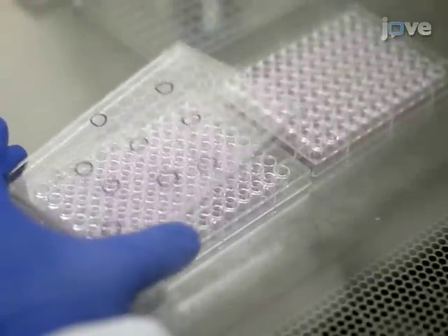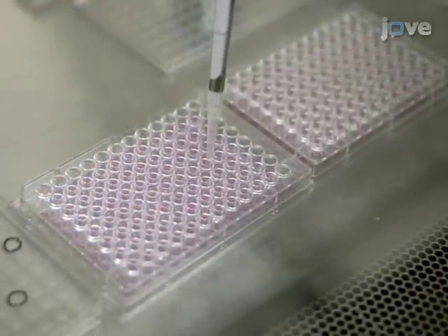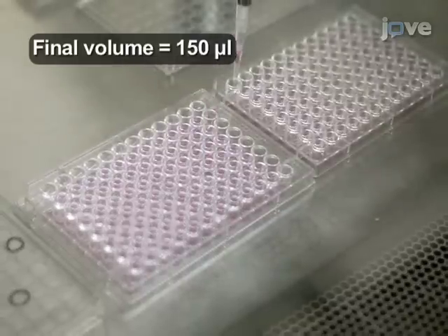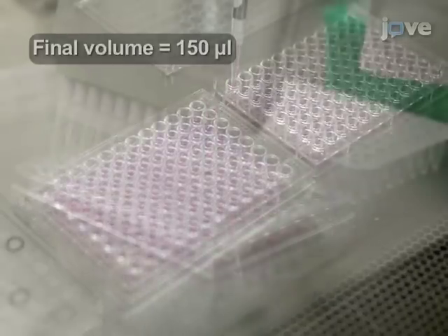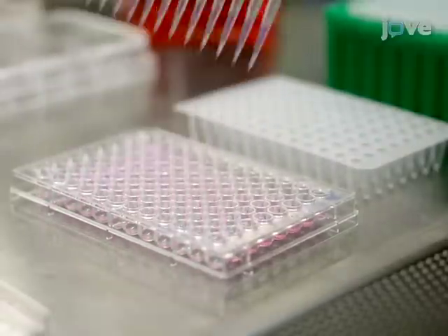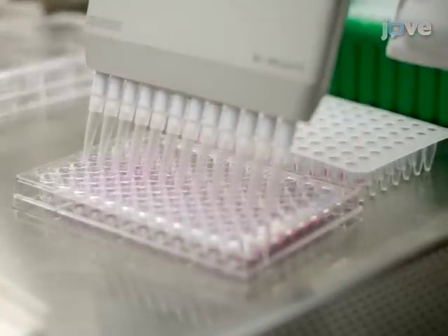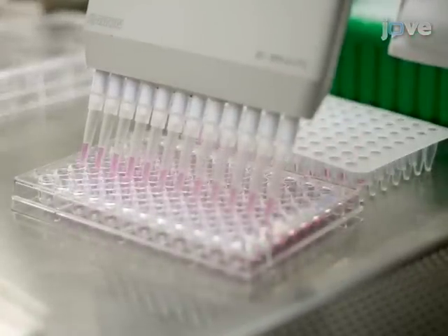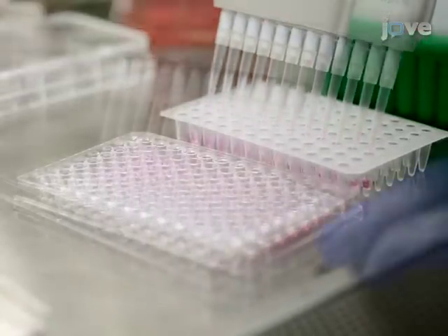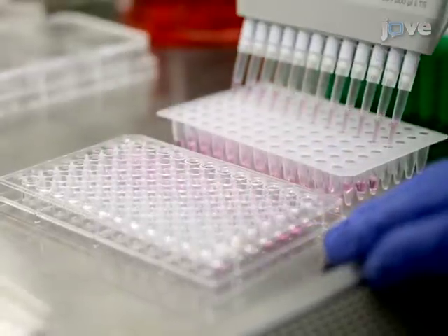For suspension cells, transfer all clones to a single 96-well plate that already contains 50 microliters of cell culture media per well, then transfer 50 microliters from each well to a 96-well PCR plate. Alternatively, for adherent cells, trypsinize clones prior to transfer to a single 96-well plate, then transfer 50 microliters from each well to a 96-well PCR plate.